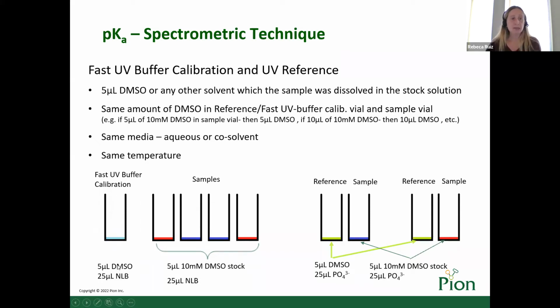If the media of the experiment changes, for example, I'm using dioxane, then the reference will be run in dioxane. If the temperature changes to 37 degrees, the reference will be run at 37 degrees, and so on.